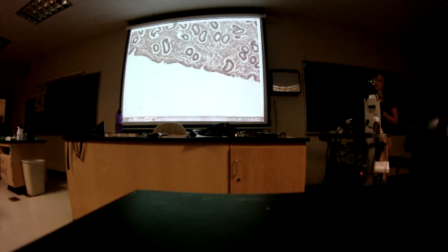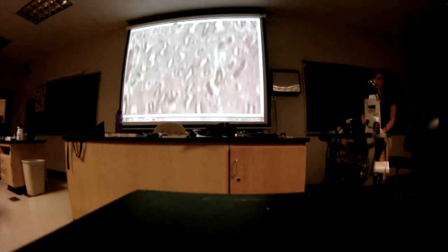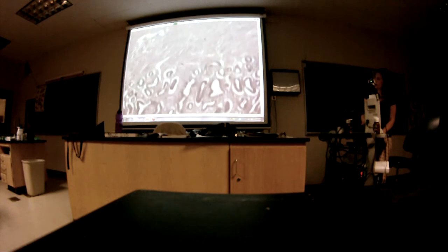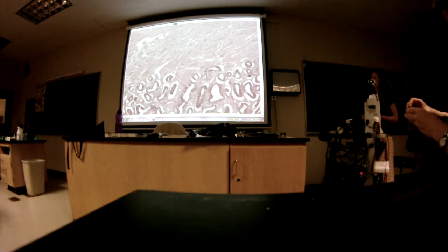This is the epithelial lining. It's a simple columnar. It's not very visible on this particular slide. Okay, so this is all the endometrium with lots of the glands. Pretty thick. And then look for the change in the tissue. See about halfway up the screen there? Changes here.